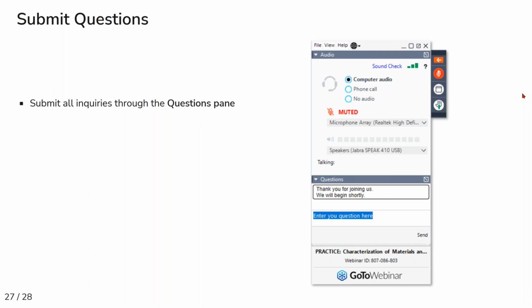And they are, together with some approaches of also using beam image shift to collect a large area at each tilt angle. If we then can keep the camera on 100% of the time, the area we can image, and therefore the data we get, will be directly proportional to the surface area of the sensor. So bigger sensors and faster cameras would really help us out.